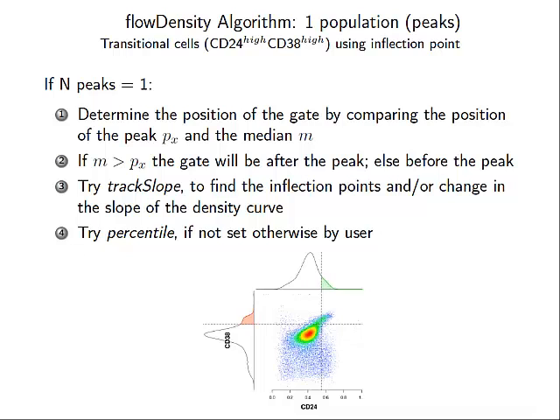It's a difficult problem. I have heard that SPADE gives you a different answer every time you start. That's a different problem. That's not related to rare cells. It's related to the way they do their sampling.